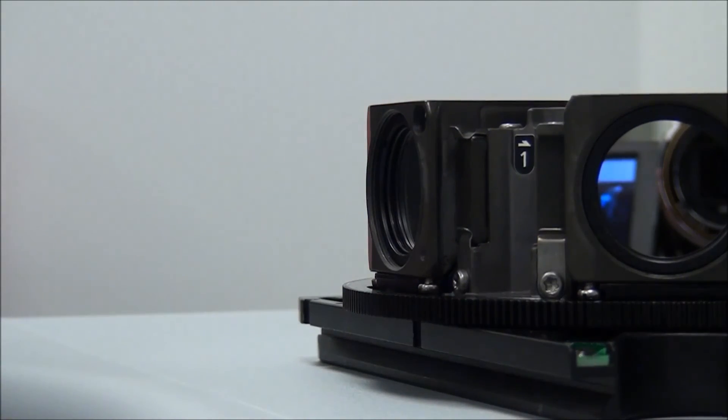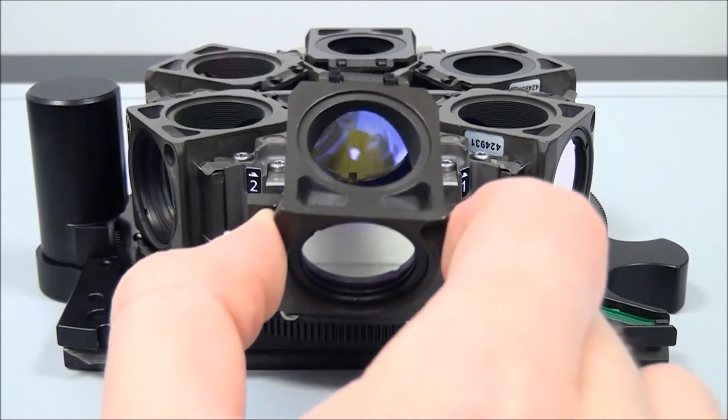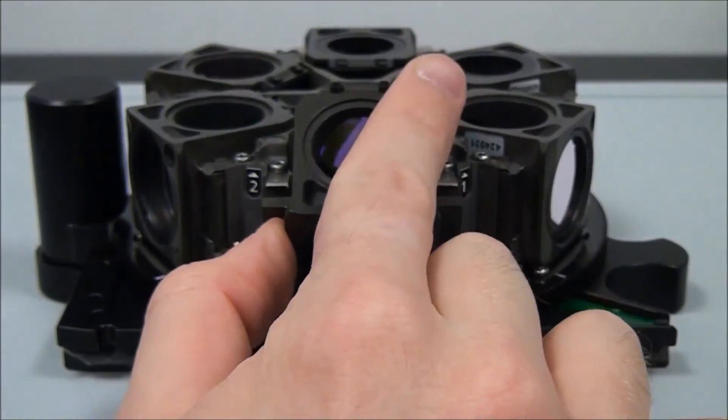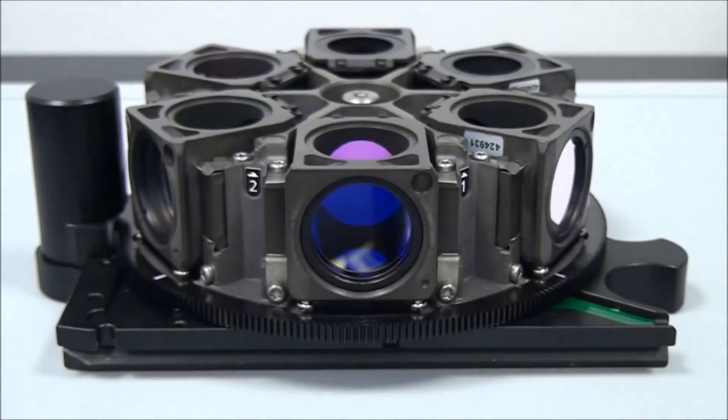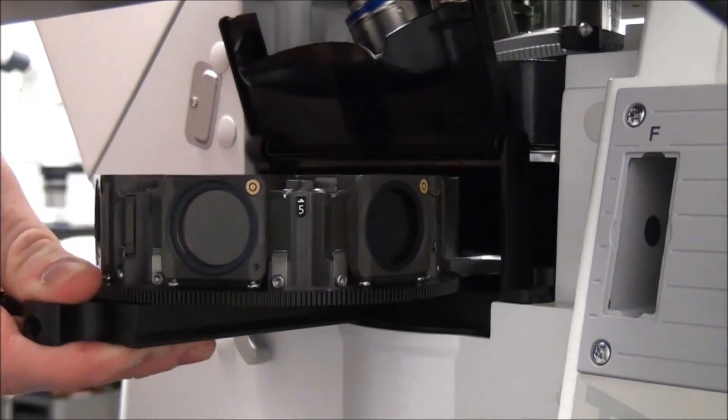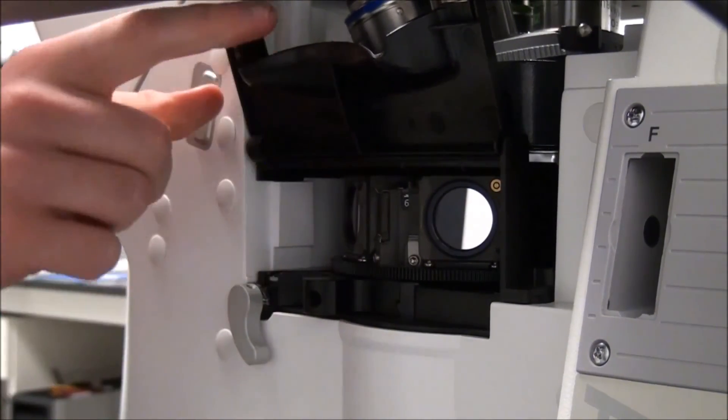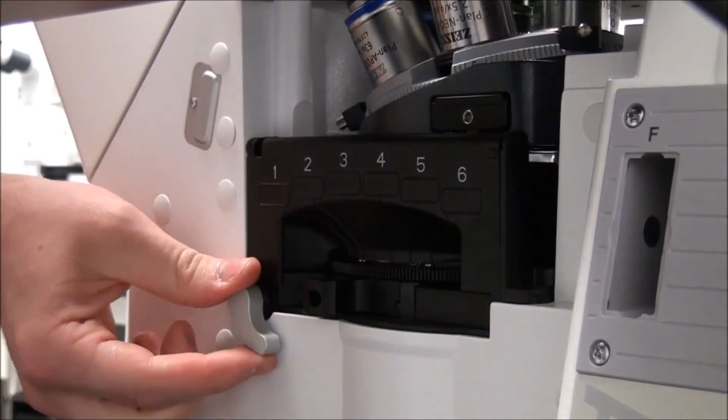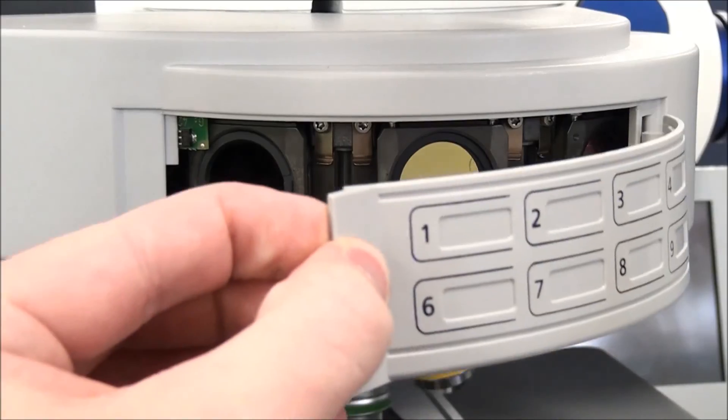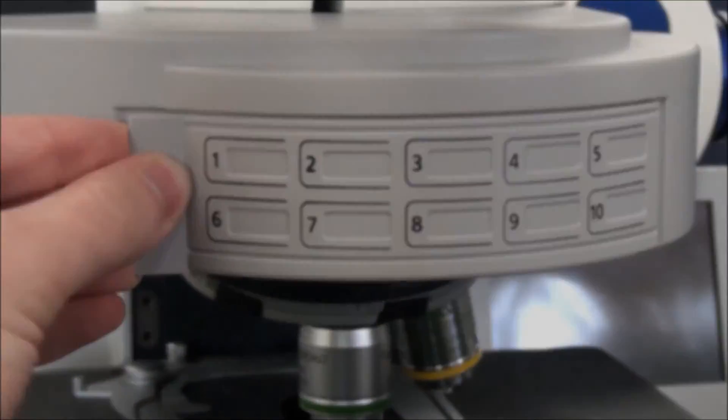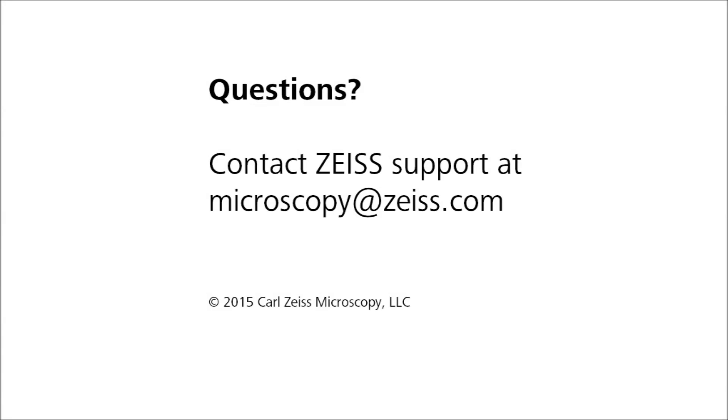Exercise caution when inserting the reflector module so as not to scratch the filters on the metal clips. Replace the reflector turret cover and restart the microscope. You can now begin viewing your samples with the new reflector module. For some stands, it may be necessary to configure the new module into the software. Please contact product and application support for assistance with these steps.